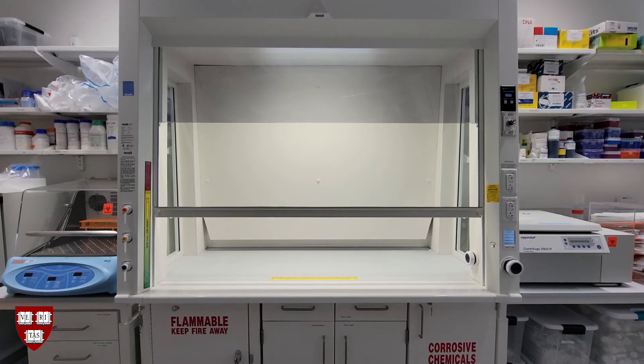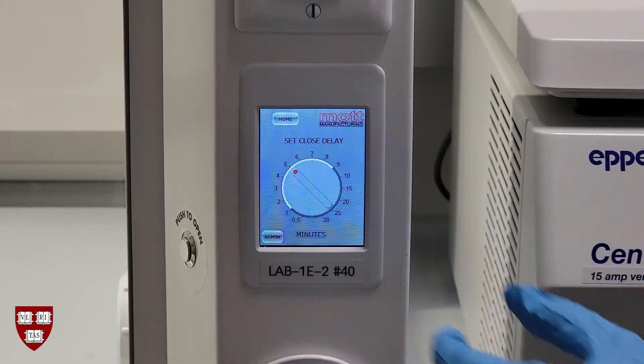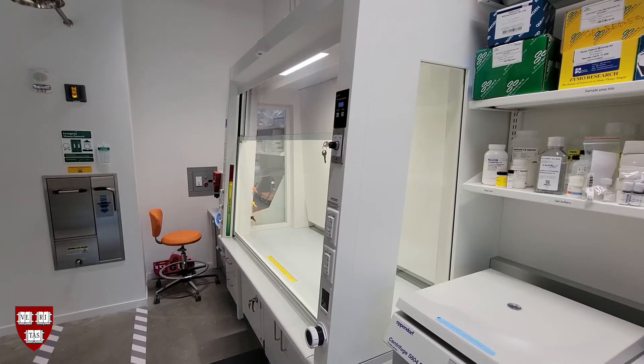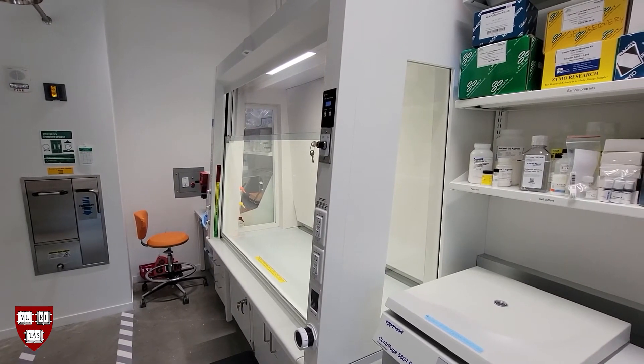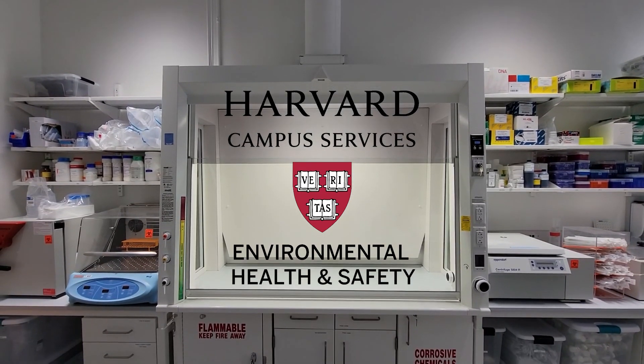To change the amount of time the sash stays open upon walking away, press the setup button on the digital control panel, adjust the time via the dial, then hit the home button. If you have any questions about using fume hoods or would like more information, please contact the Harvard University Environmental Health and Safety department. Thank you.